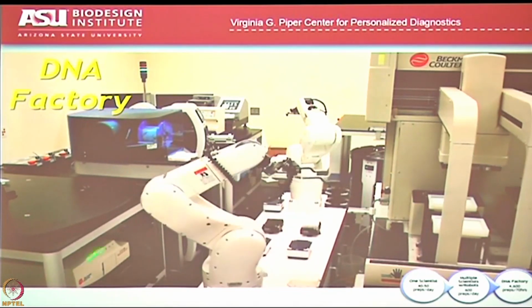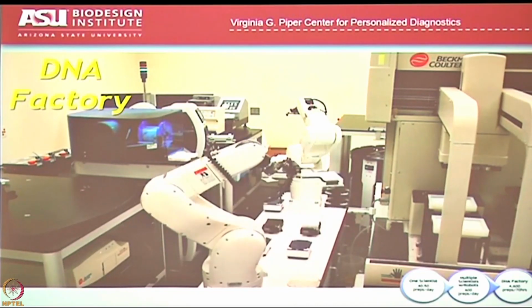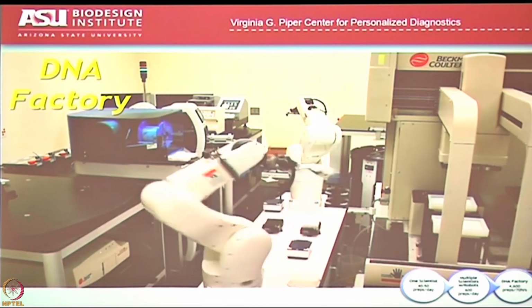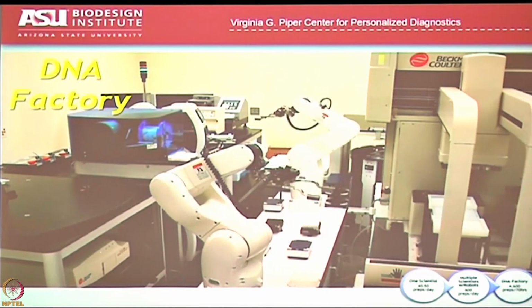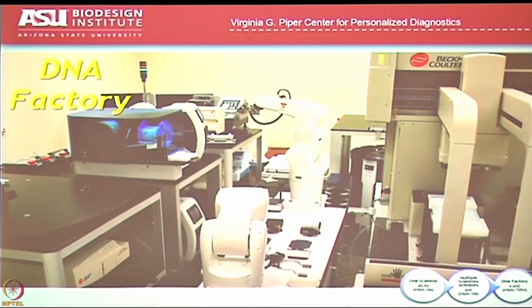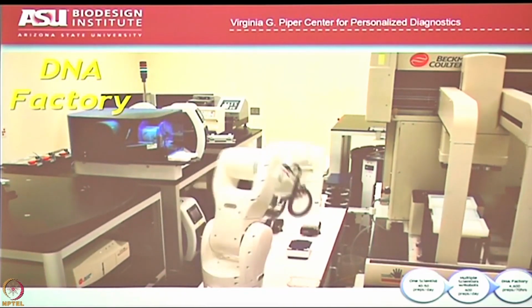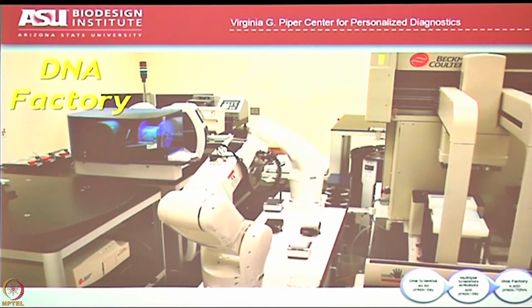And then this device over here will read the optical density of the DNA after you've made the DNA, the OD260. So we can actually measure how much DNA we're making, and the robots will automatically adjust the concentration to make them what you want them to be. So all in all, we went from doing 50 mini preps a day to 600 mini preps a day to now 4,600 mini preps in 70 hours, start to finish, growing bacteria to getting purified DNA. So it really accelerates what you do, and it also gives you a little bit more certainty that what you're doing is working.